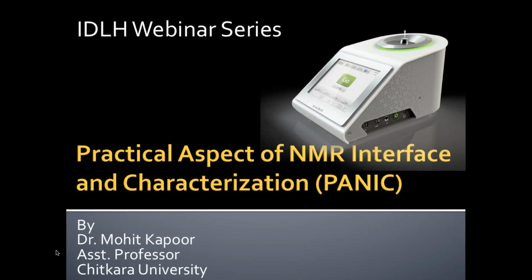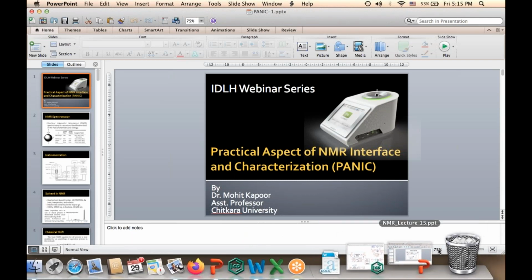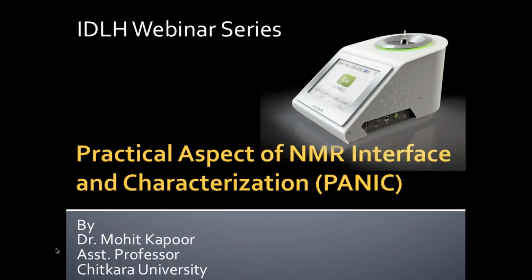the NMR spectrums, because once you undergo research, and you have several reactions or several molecules to identify, the tools and techniques which help to get the structure quickly are important. So that's my concern here, that we will see how to identify the structure quickly.